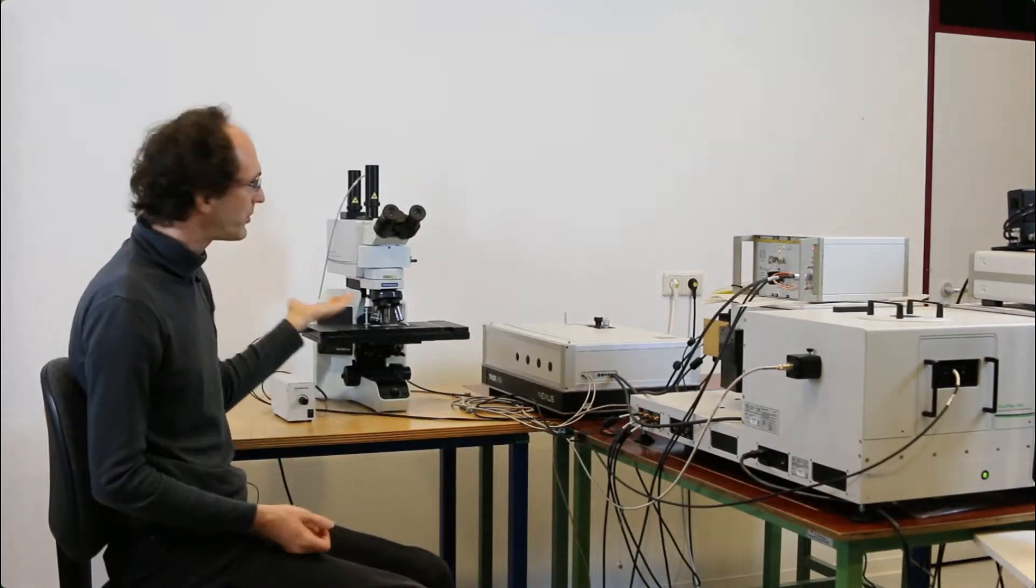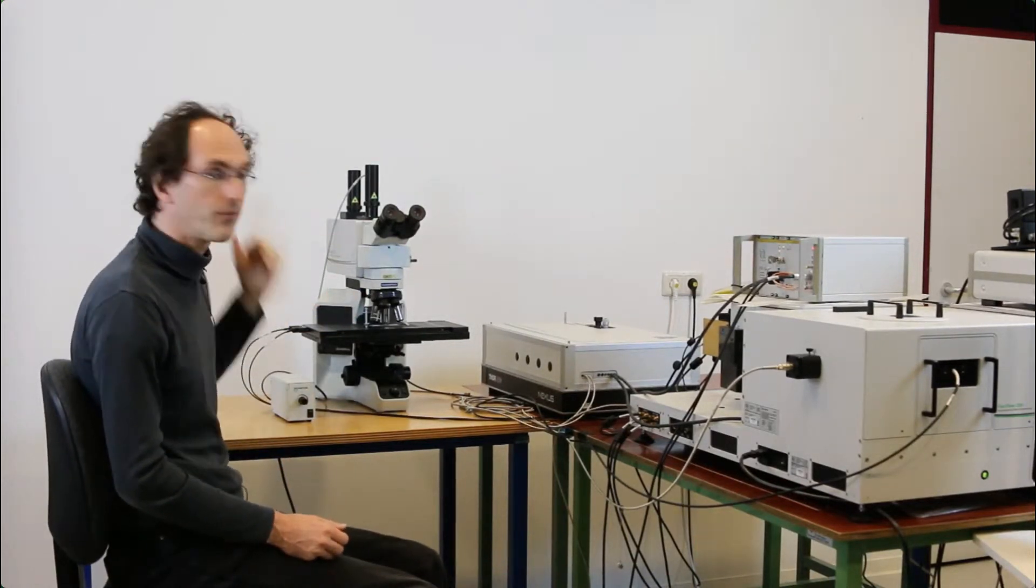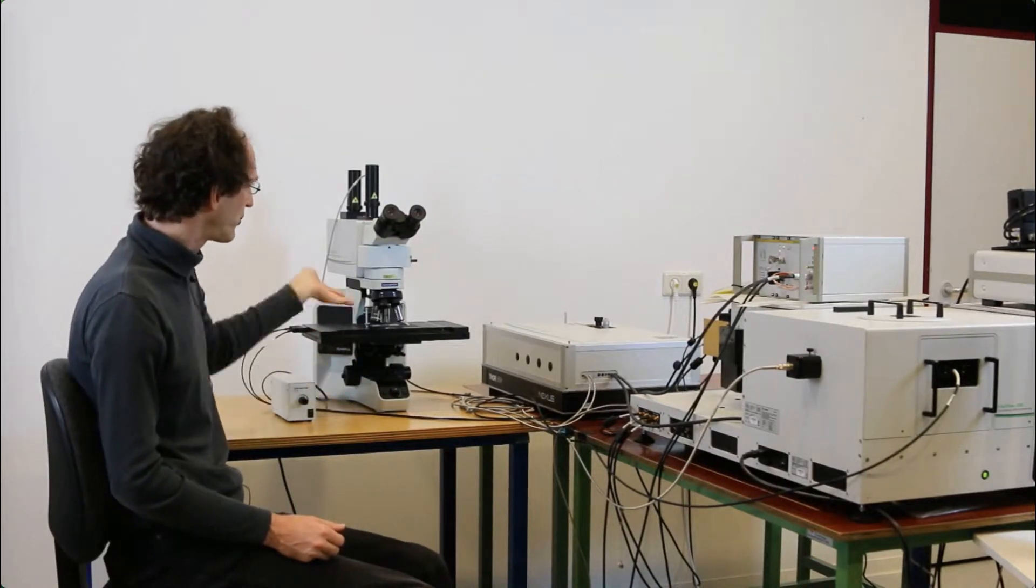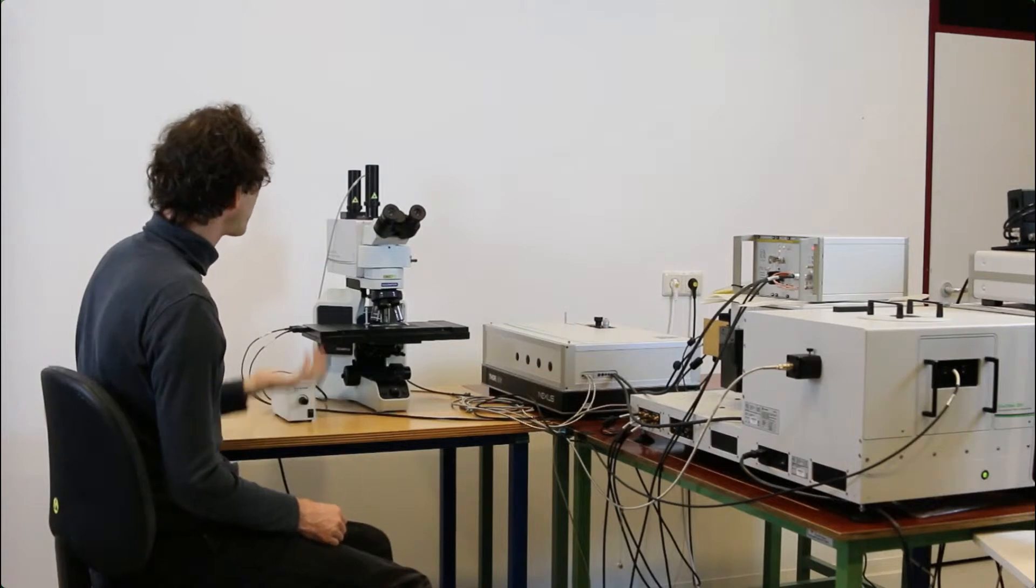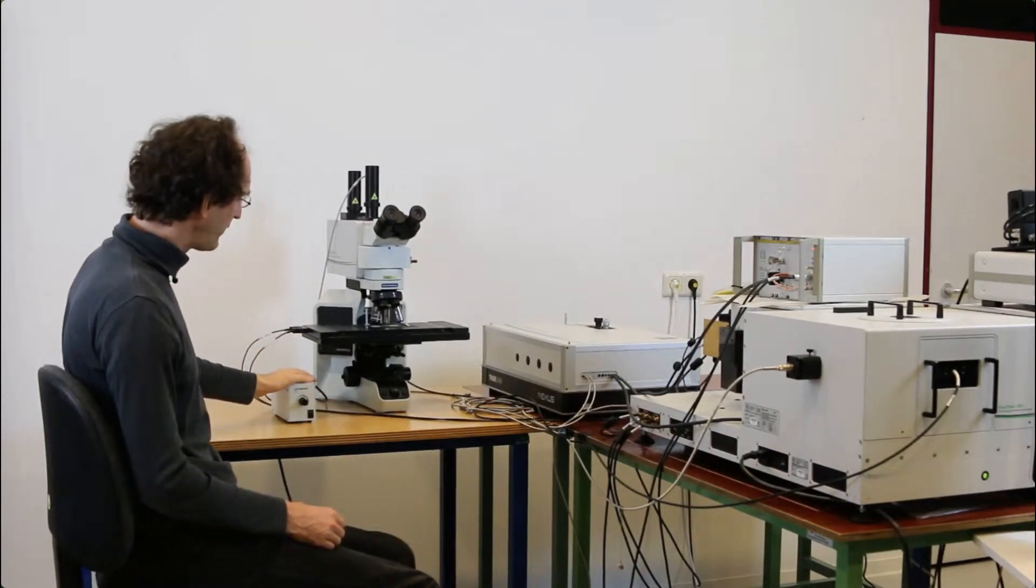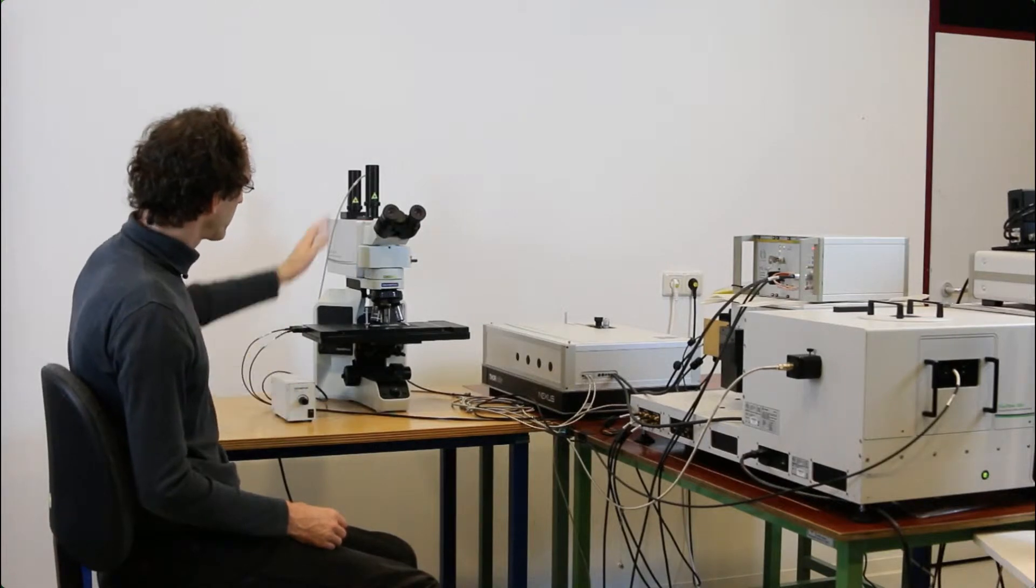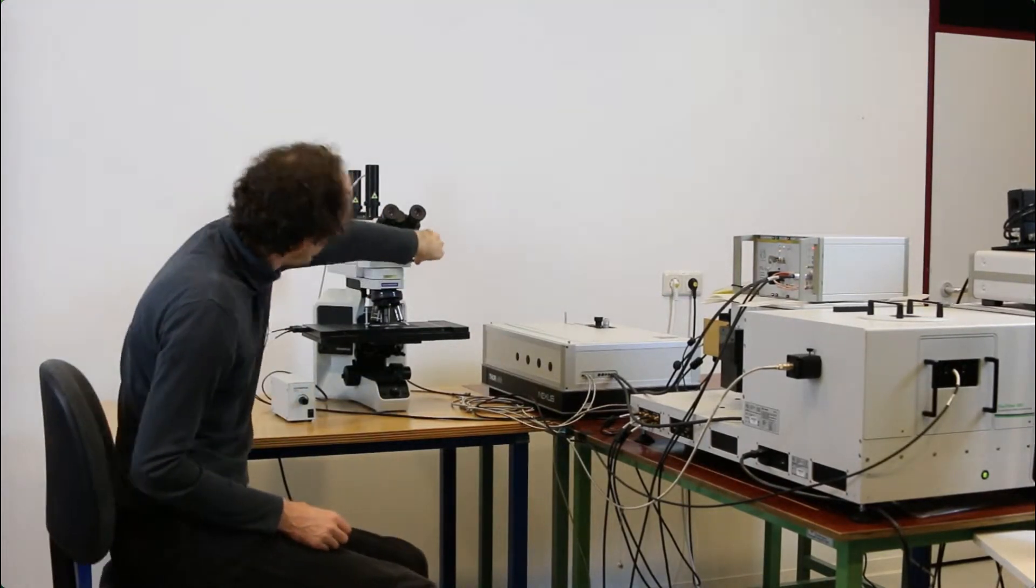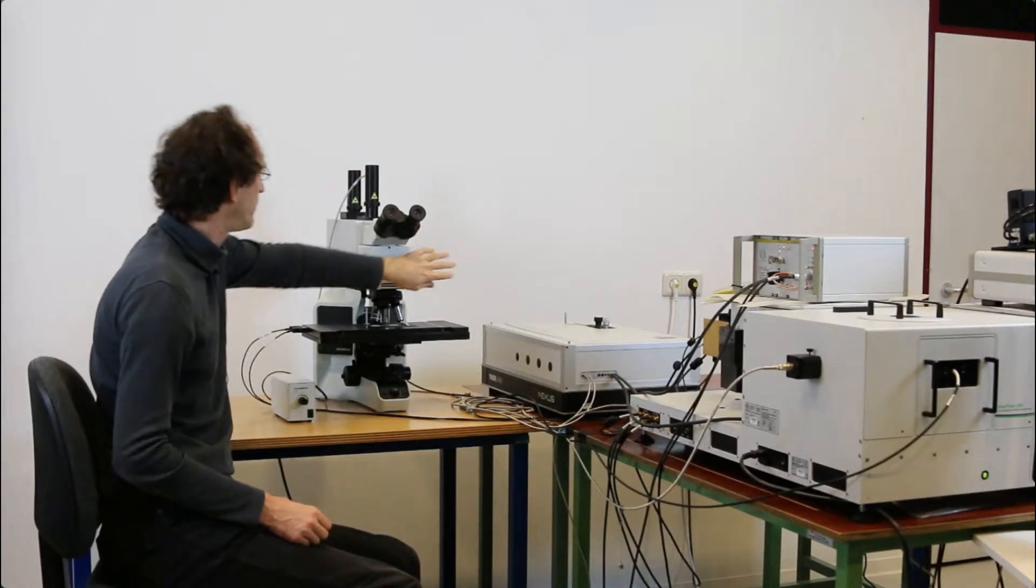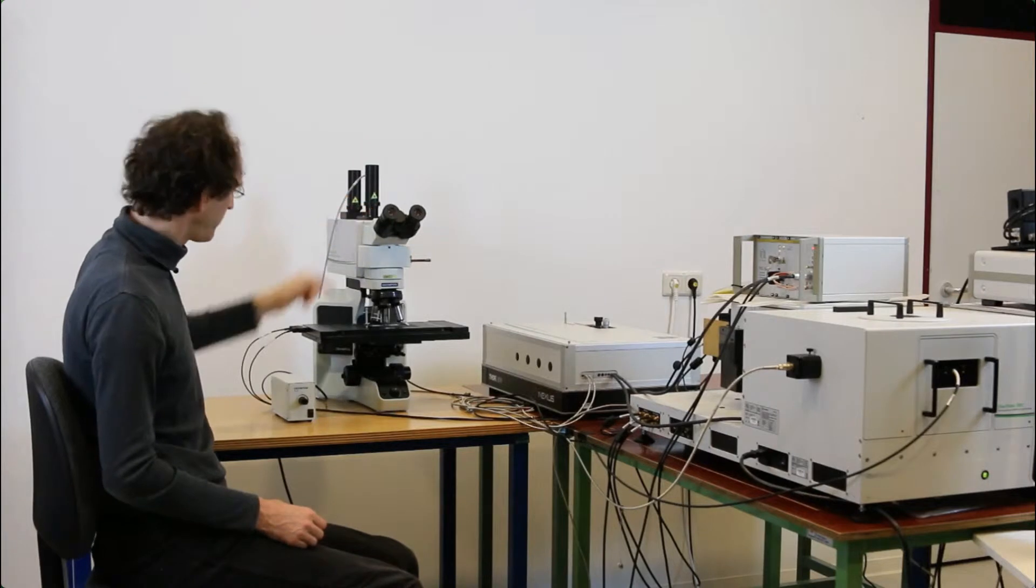The first thing that you always need to do is to focus the sample and select the region to measure. Here I put on a daisy pollen slide, and this is easiest to focus with a bright field and the ocular. In order to do that, I have to take this slider out.